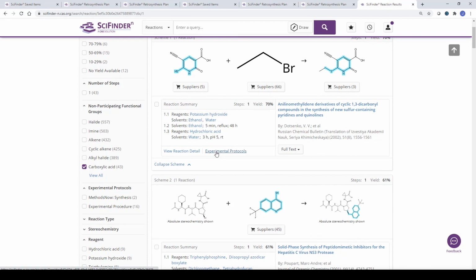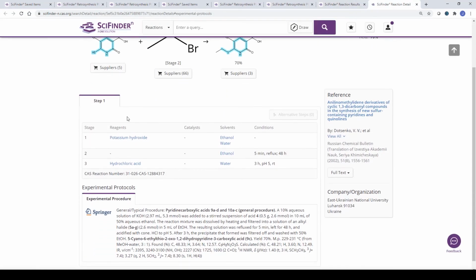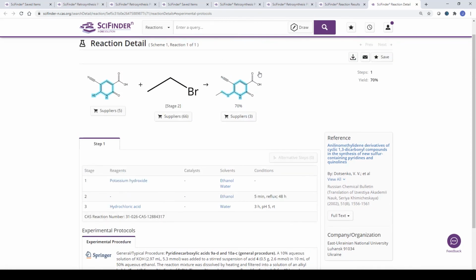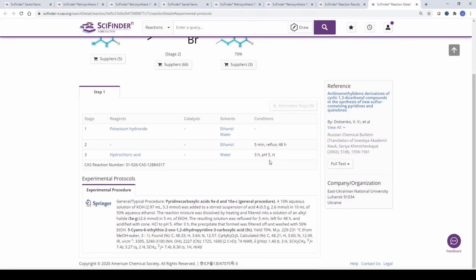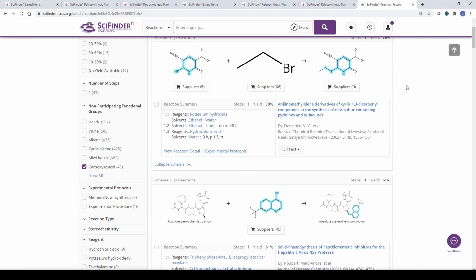The first one is the experimental procedure that has been there already for a long while. So here we have a copy and paste out of the original source. We see also here the precipitation of the final product. Of course, this always has to be adjusted for your real molecules then, but maybe this might work as well with the filtration as a cleanup.